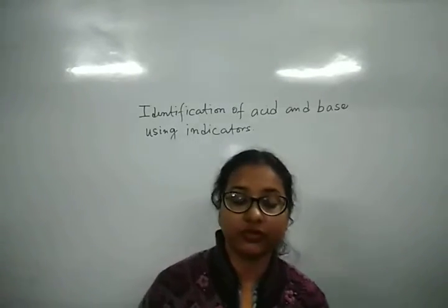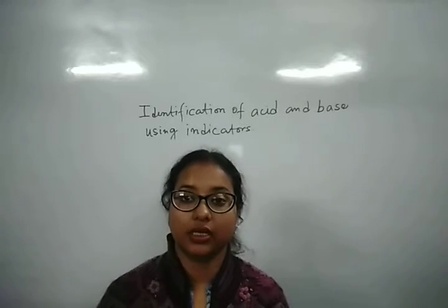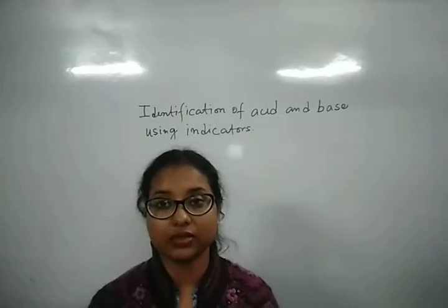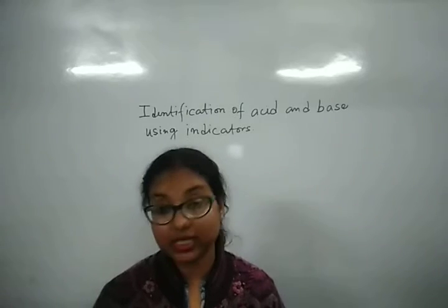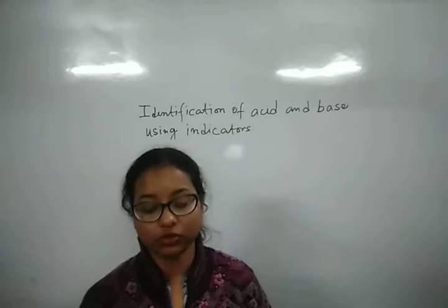Today we will continue with the topic which we did last week, that is identification of acid and base using indicator. Last week we did it with litmus paper, and today we will do that with some other indicators.